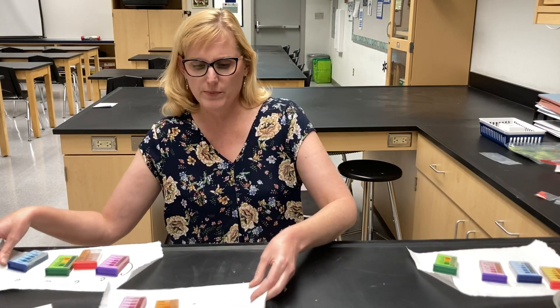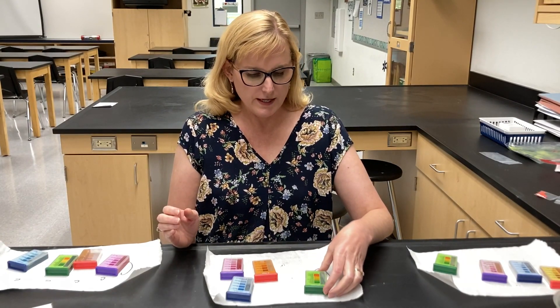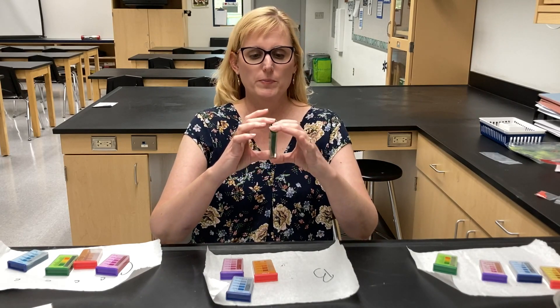Now let's do sample B. Sample B results very much surprised me. This time let's start with pH — I ended with that for sample A, but let's start with pH here.